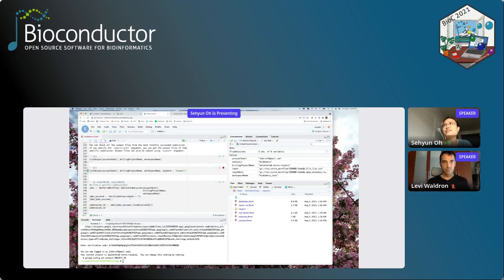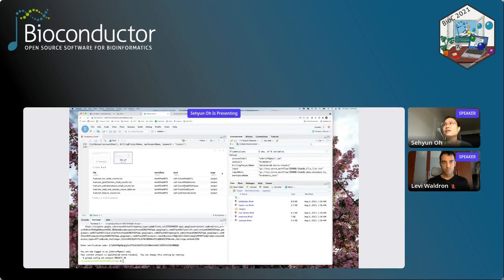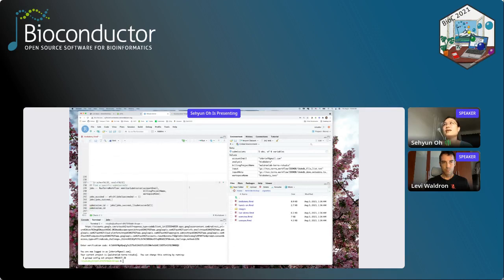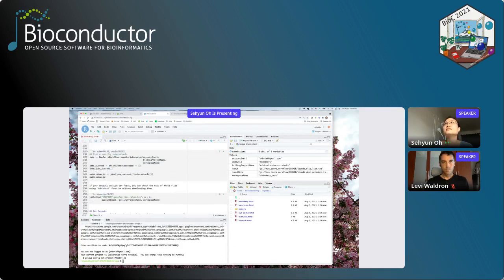Let's do this. It takes a little bit of time because, for example, this workflow has several hundred outputs, since it goes through all the log files too. But let's say any output file has human in its file name. I got 5 outputs. And this part, you can use to find a specific submission. This is probably less frequently used, but you can use it if you want.